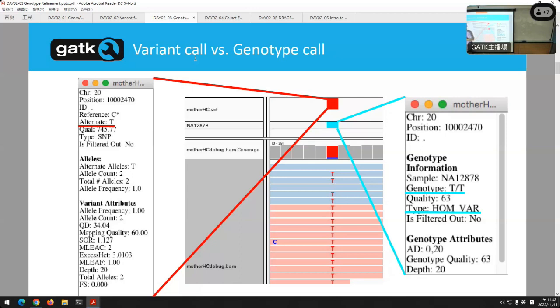It's not that the HaplotypeCaller did anything wrong. It did the right thing. It sees some C's here. So is that heterozygous? If out of 40 reads, 4 of them are C's and 36 are T's, is it heterozygous or homozygous? It should be homozygous, mathematically. But why are there C's? If it's homozygous, why do I see any C's?